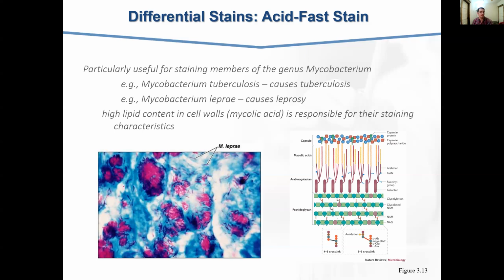The primary stain used in acid-fast staining is carbol fuchsin, which is lipid soluble. Very important that it's lipid soluble. And apart from being lipid soluble, it also contains phenols, aiding in the penetration of the cell wall, which is further assisted by the addition of heat. That gives you an idea of how resistant these cell walls actually are, that there are so many new steps that need to be included just for us to stain these organisms.